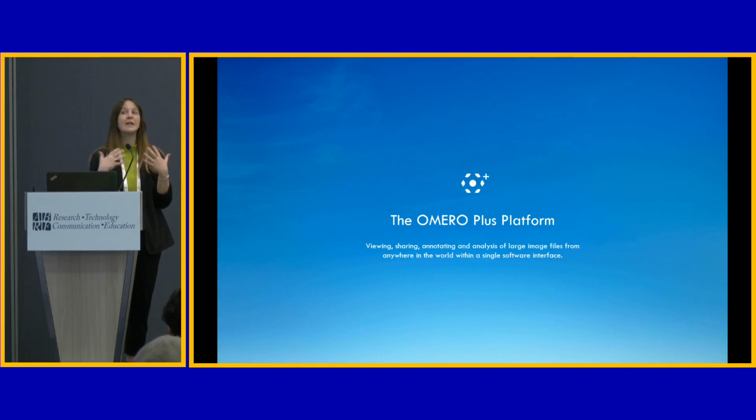acquisitions are quite large. So they could be large in volume of a single image. Some domains, the acquisition that we're talking about is in the terabytes range. Certainly in the gigabytes is also quite common. But it could also be in the size of the collections. Maybe individual images are small, but you have many, many of them. And so looking at these becomes actually complicated. We also work with a lot of proprietary file formats in bioimaging from various microscope vendors, and so this also presents a challenge in just accessing the image data and building interoperable solutions.